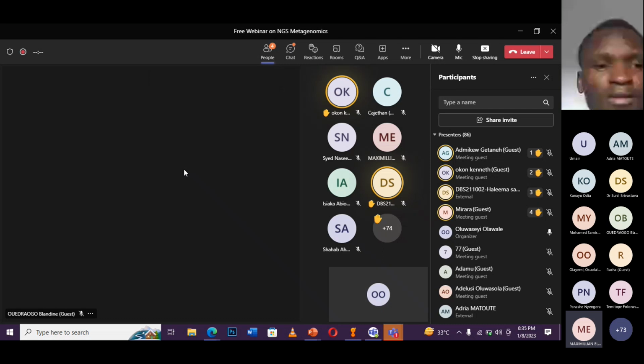So even in clinical, you can explore metagenomics. And while you are doing that, you have access to a whole lot of microorganisms at the same time. Because by the time you start investigating the genes in a microorganism's whole genome sequence, you could find it there. So genes in the whole genome sequence of a bacteria could be found in metagenomics.